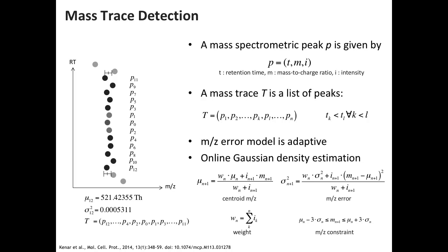Yeah, and that is the idea. Because the instrument error is an overestimation of what we have locally. So the idea here is really to find a mass trace where the error that we estimate is consistent with what we see on this mass trace. So it's basically it aborts once the data it sees becomes inconsistent with its internal error model.